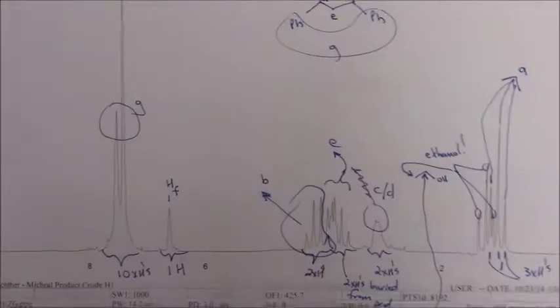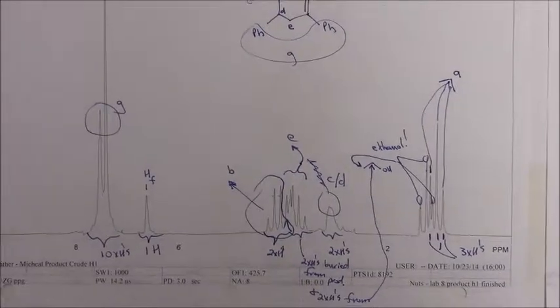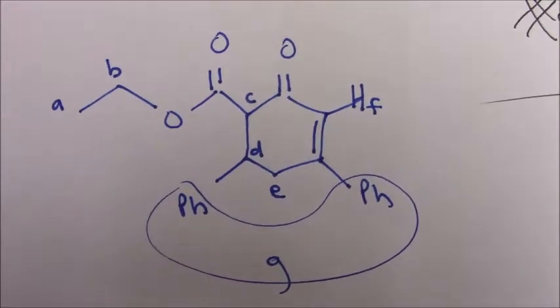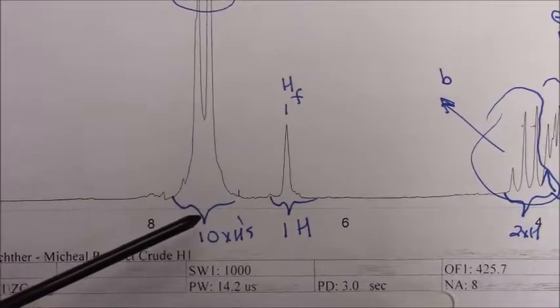So you run on ours, it looks like this. And I have this posted on the fridge or something, so I've already partially assigned it. I've already labeled this for you, right? So you can see how I've labeled it there. You can see how the aromatic, right?